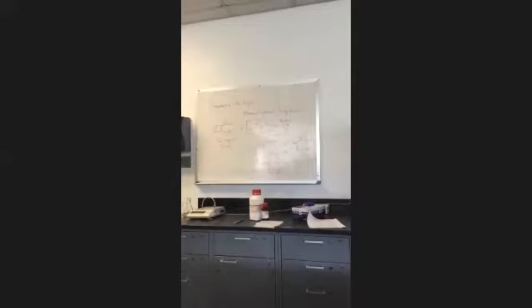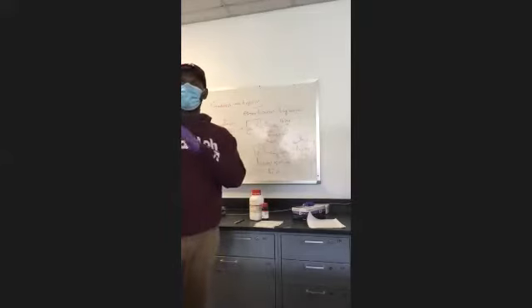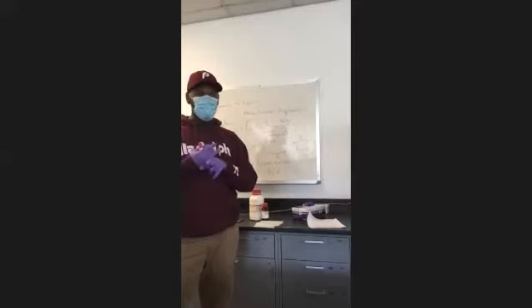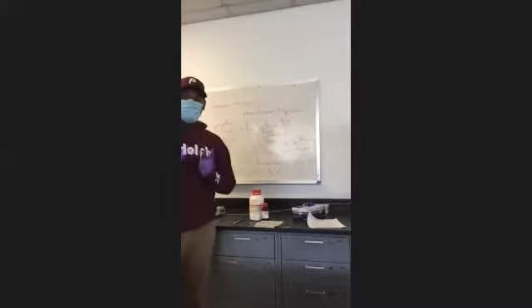What we're going to do, for those of you who have the handout, is actually cut all the values in half. All right. So instead of 13.8 grams of salicylic acid, we're going to cut that to 6.9 grams. Instead of 13.5 milliliters, is that what it calls for in the procedure of acetic anhydride? Is it 13 milliliters, something like that? Yeah, 14. 14, we're going to cut that to 7. Everything is going to be cut in half so we can conserve resources.